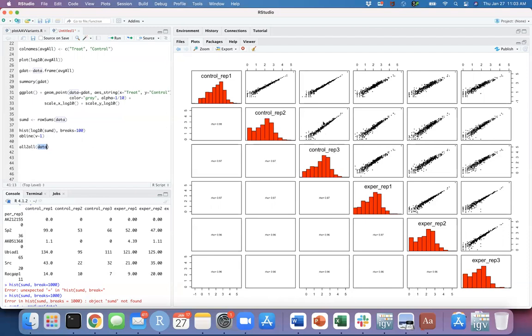If you see something wrong in this plot, if it's not reproducible, meaning you don't get similar counts in both replicas, then there's something wrong, and then you might need to remove that sample. Here, in this case, these are very good, but you always see this kind of variation a little bit.